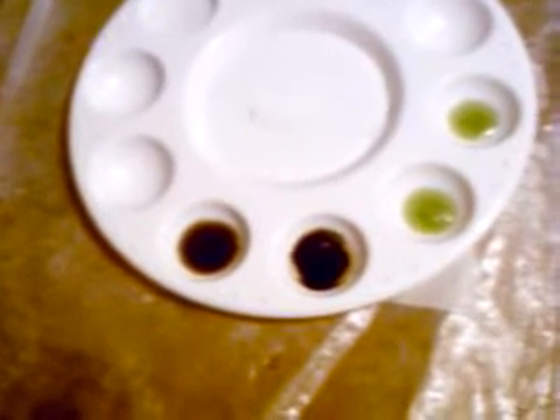We have two of the darker spots on the dish. The one farthest to the left is the spot test done with stannous chloride and aqua regia. The second one over to the right is done with potassium iodide and aqua regia. The other two green spots are the actual ore.